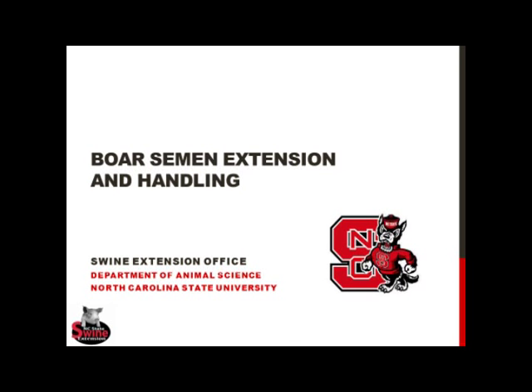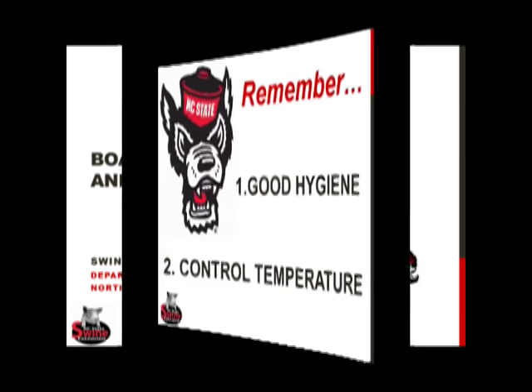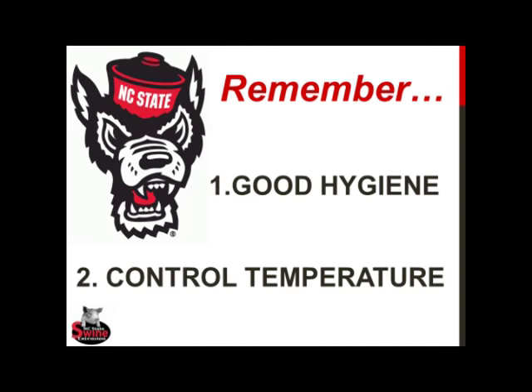Boar semen is commonly collected on the farm for use in artificial insemination or as part of a good breeding soundness exam. However, collected semen is fragile and is sensitive to many thermal, physical, and chemical stresses after ejaculation, and the fertility of a collected semen dose may suffer if proper procedures are not followed. Many of the common problems contributing to poor semen fertility can be traced back to one of two things: poor hygiene, or a failure to maintain proper temperatures when extending, and so we'll want to keep these two things in mind throughout the entire process.